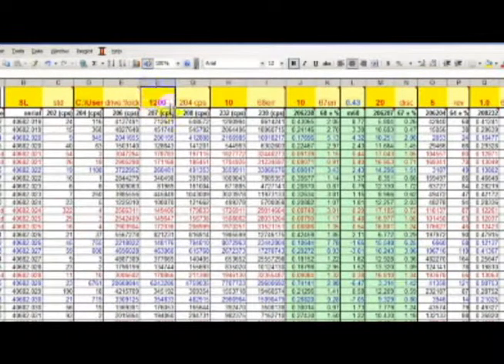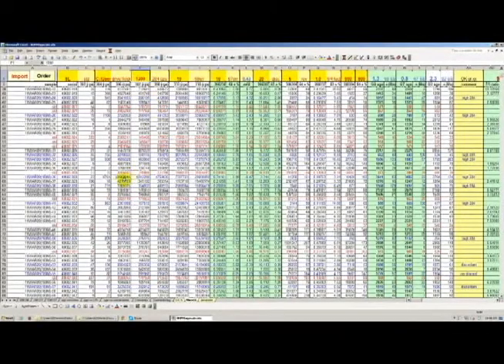So I'm just going to go ahead and change this to 1200, and you'll be able to see that as I change this and then hit order, a lot of these grains that were highlighted in blue are either not going to be highlighted anymore or are going to be just filtered out by some of the other thresholds that we've set if they violate some of the maximum uncertainty filters.